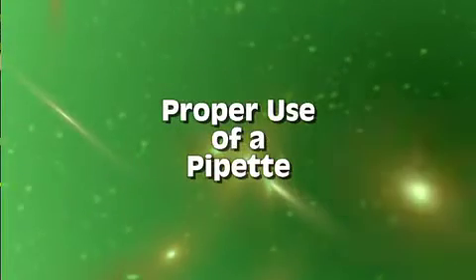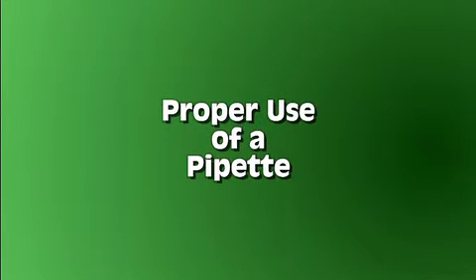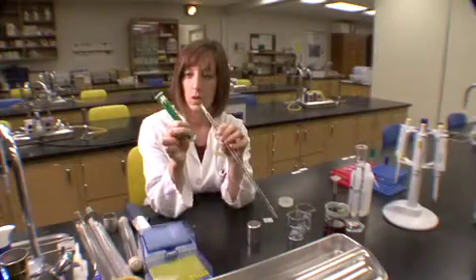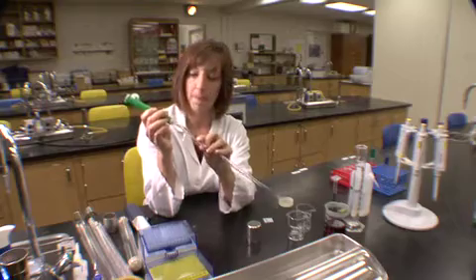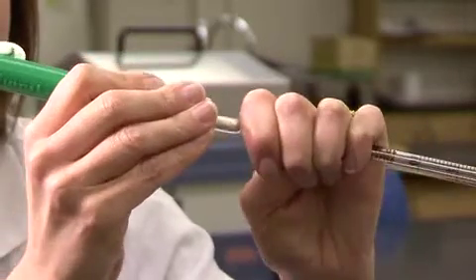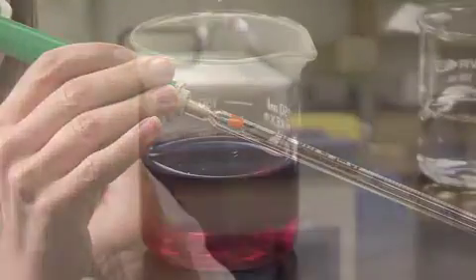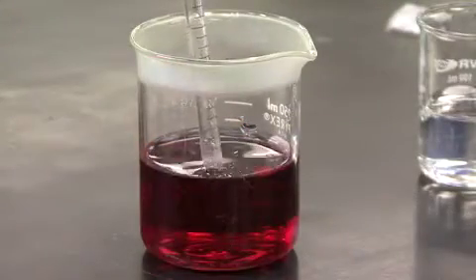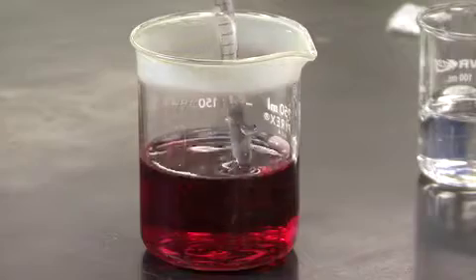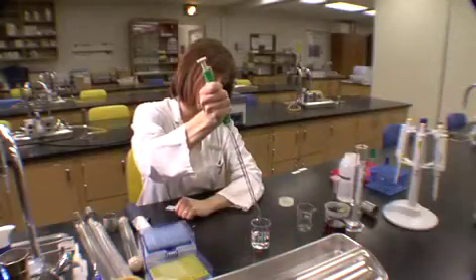Volumes in the range of 1 to 25 milliliters are commonly dispensed with a glass or plastic pipette, especially when repeated dispensings are necessary. Start by grasping the pipette nearer the top and snugly place the pipette into the flexible opening of the aid to create an airtight seal. This green pipette aid works by rolling the wheel up or down with your thumb to move a plunger within the pump.